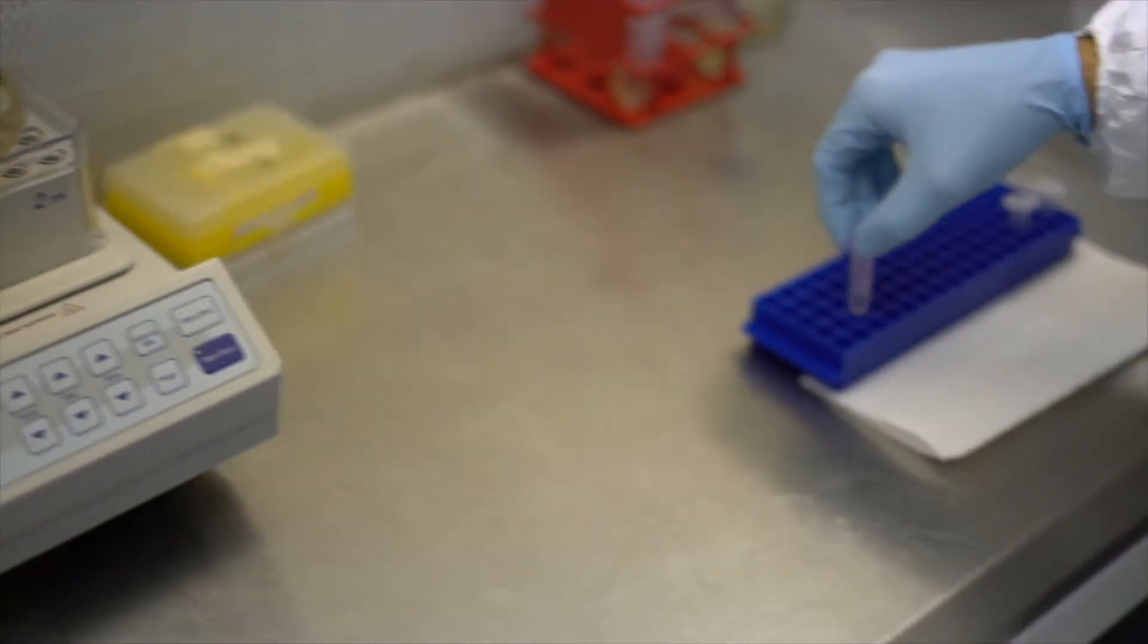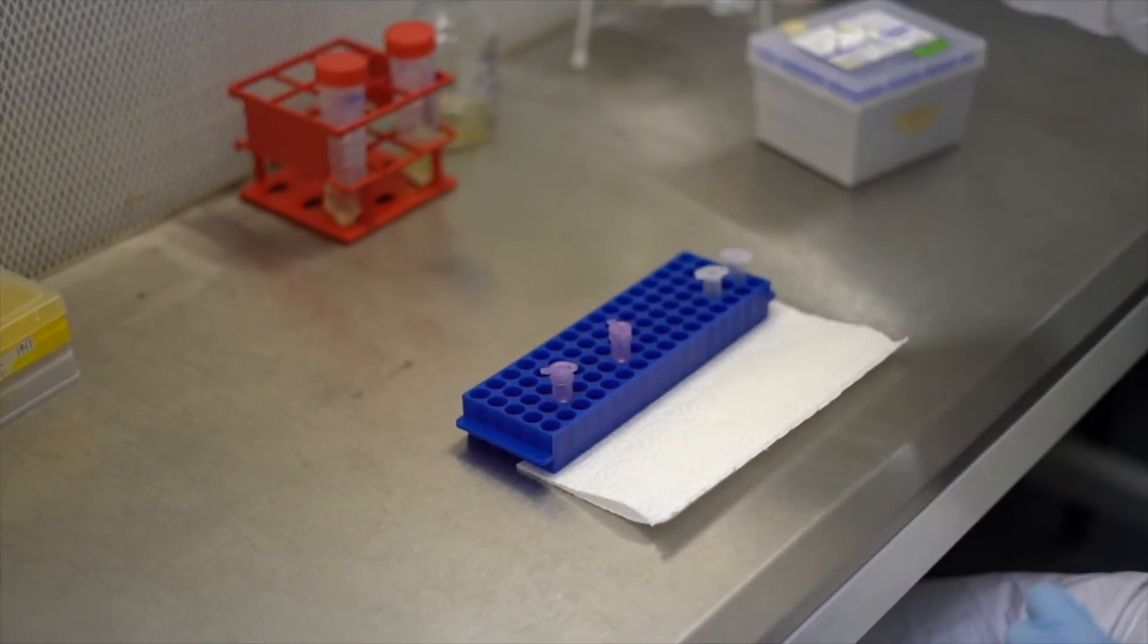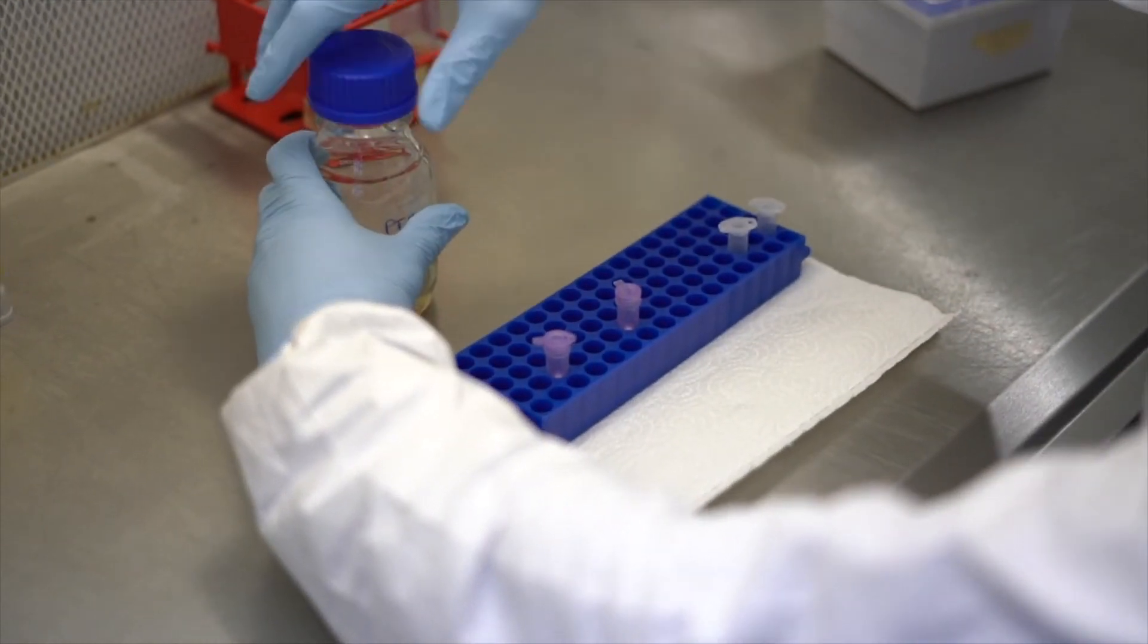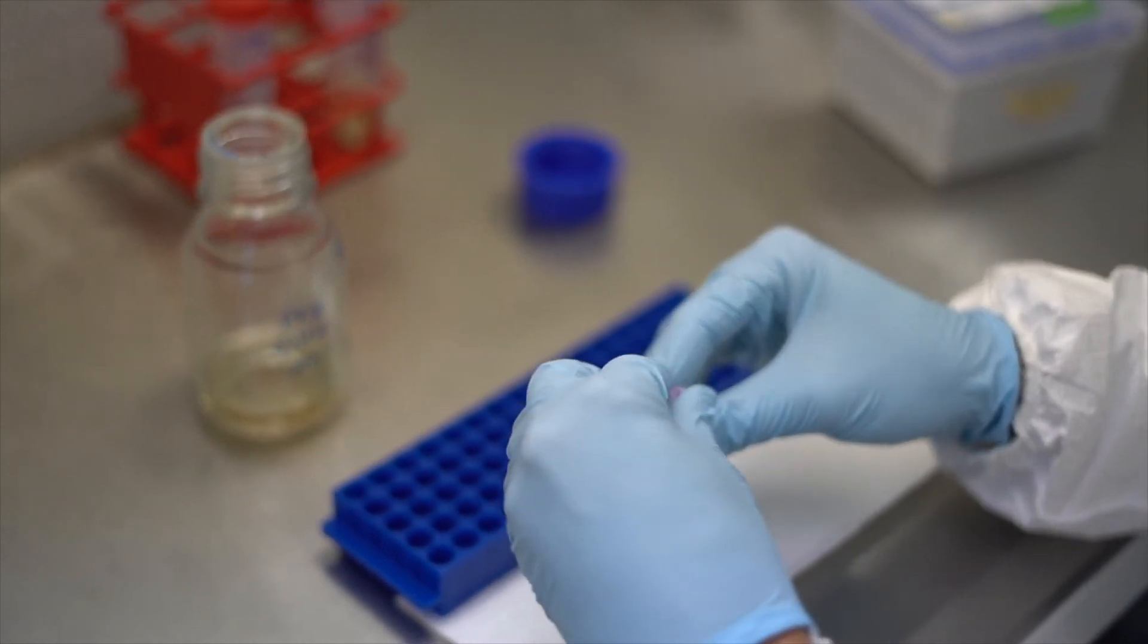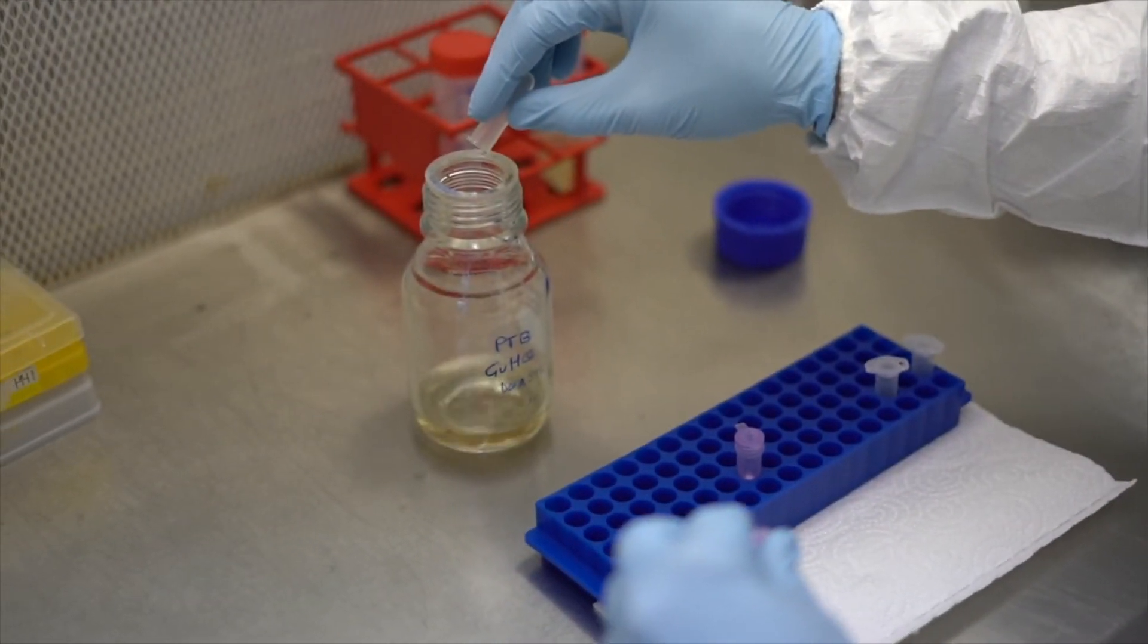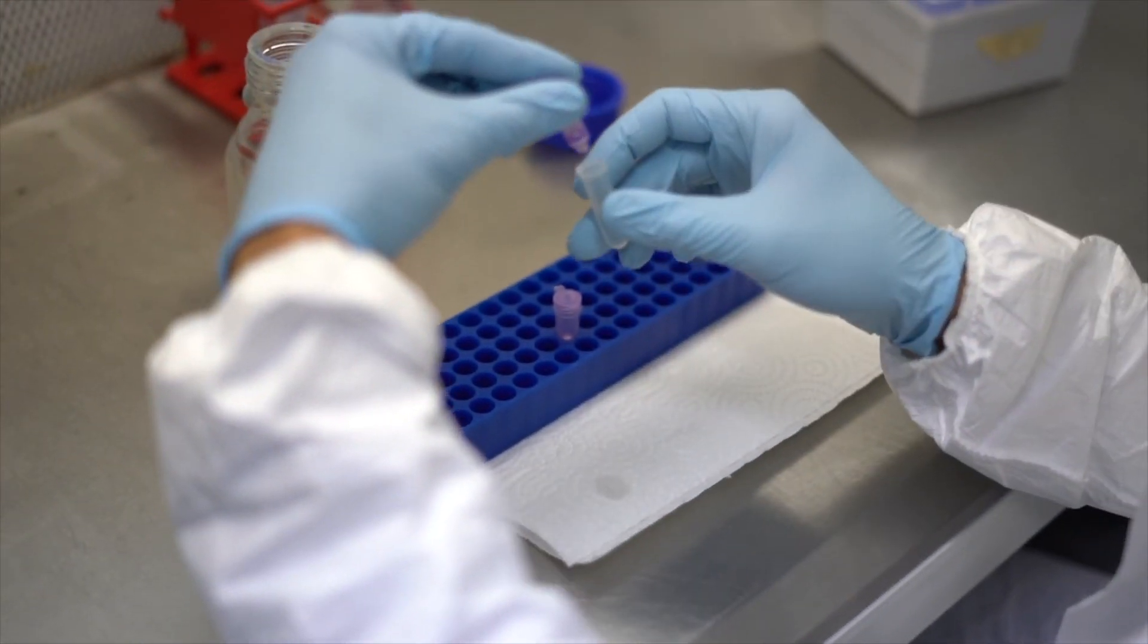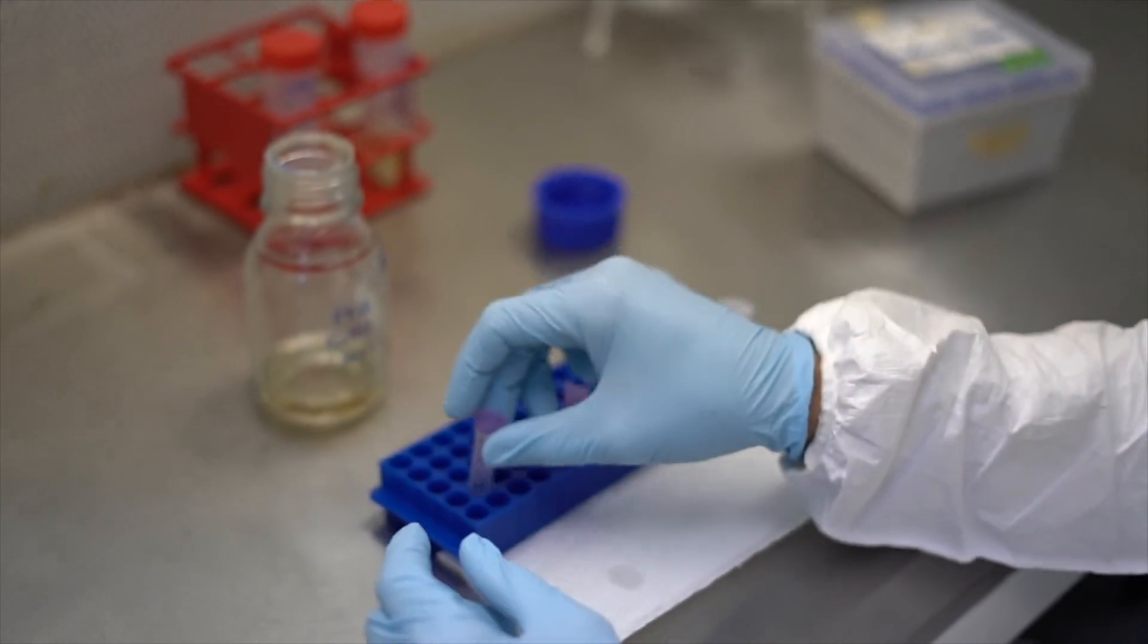We add again 700 microliters of the PE buffer and centrifuge again at 3300 g for 1 minute. Again we repeat the previous step. We discard the liquid and then we will centrifuge once at full speed. We will dry-spin it at full speed in the bench centrifuge. Be careful not to touch the bottom of the MinElute column with the collection tube.